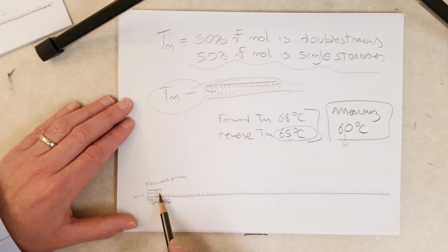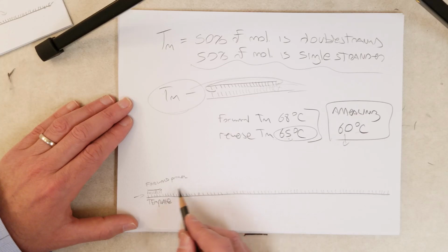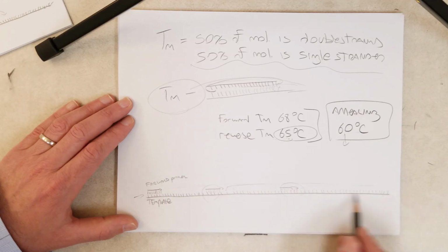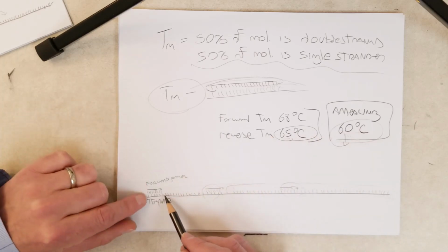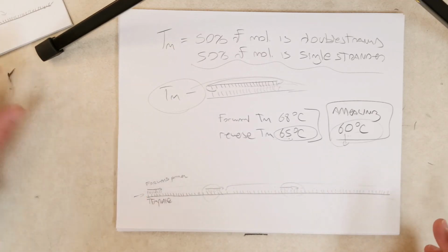But if we were to go really low, to like 30 degrees or something like that, so room temperature, then that would encourage the primer to misprime, to bind to other locations. Even though the complementary base pairing isn't perfect, if we use a really low temperature, it doesn't matter. It'll stick to the wrong locations. And then what we'll end up doing is copying the wrong DNA. Now, we don't want to copy these little parts in here. We want to copy this whole thing. So choosing an annealing temperature that is low enough to allow your primer to anneal to the template, but not so low that it's going to anneal to the wrong location, is one of the important aspects of performing a polymerase chain reaction.